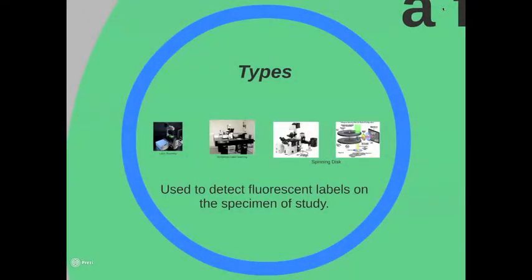In traditional wide-field microscopy, the specimen of interest is bathed in light from a mercury or xenon source. Then the image can be viewed by eye through the lens or captured on an image capture device. Using confocal, a more focused beam of light from a laser, for example, is scanned across a specimen. That small point of illumination is brought into focus with the objective lens and scanned by a computer.